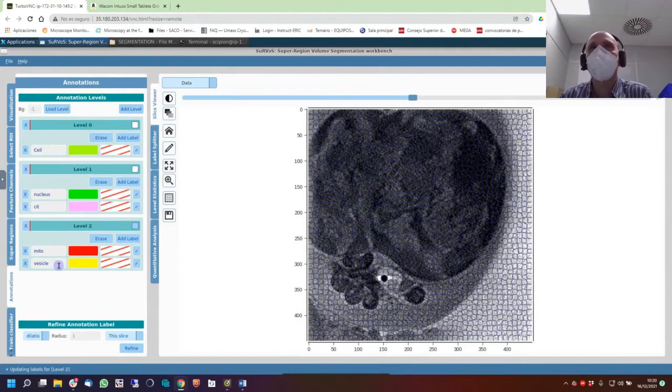Probably if you go deeper on the Python scripts, you can try to trick SURVOS to do it. But for the moment, the best thing is to keep the drawing close to the desktop, or just print screen to remember exactly the position and the name that you could put here.